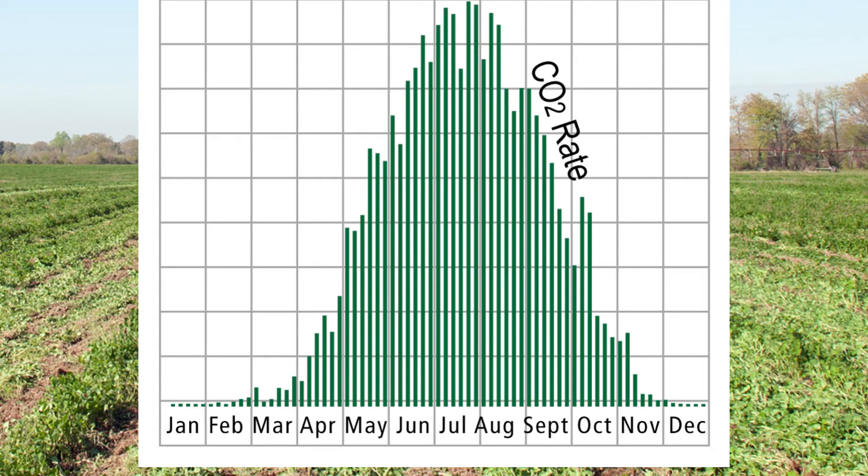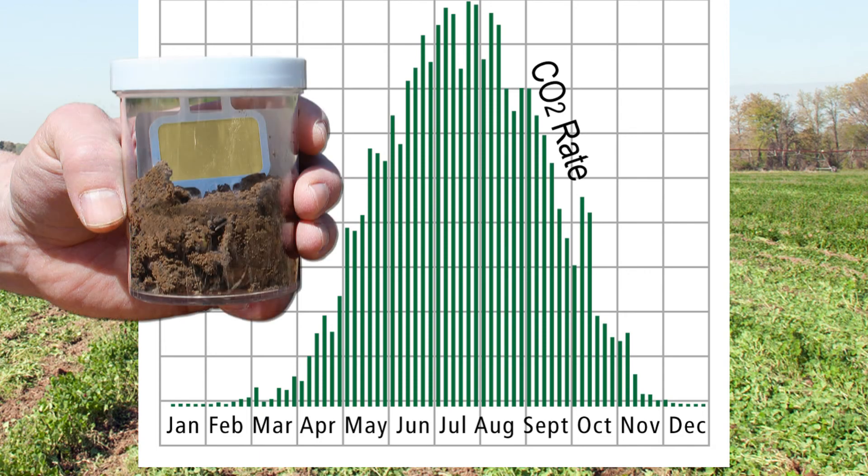Of course, if you had no moisture in the soil, you'd have some very low numbers there. So what we're trying to do is just move this kind of paradigm into soil testing and get people to start monitoring it. We're not saying we know exactly how to interpret it, but to start looking at the life of your soil is one of the important things.